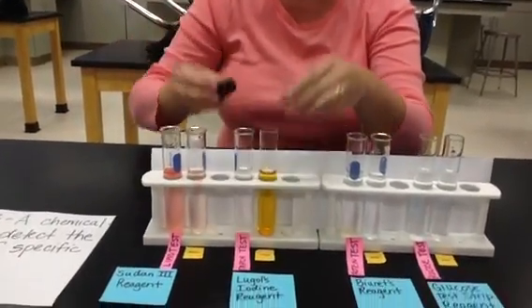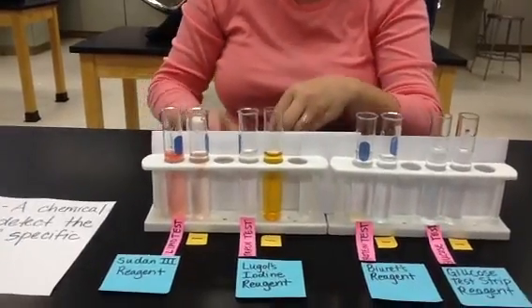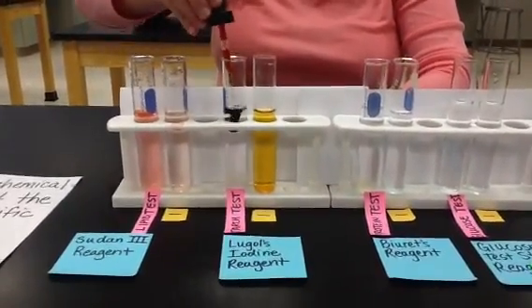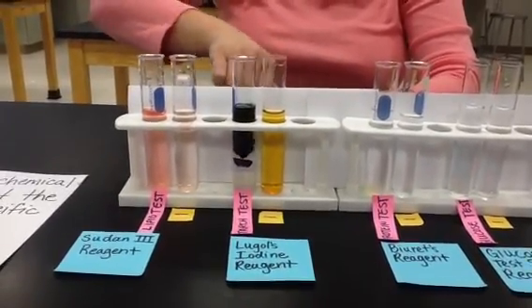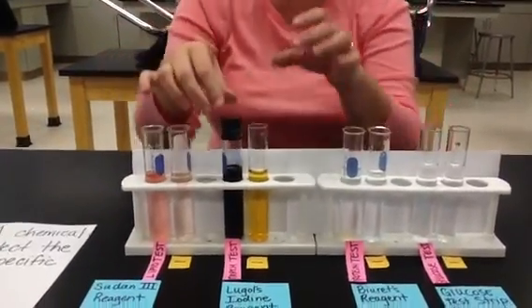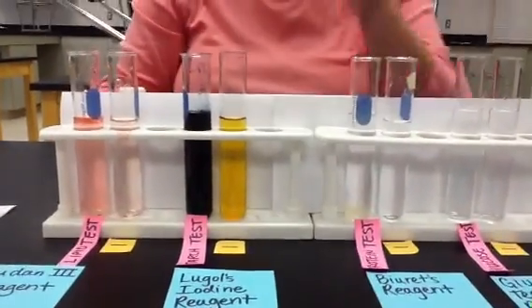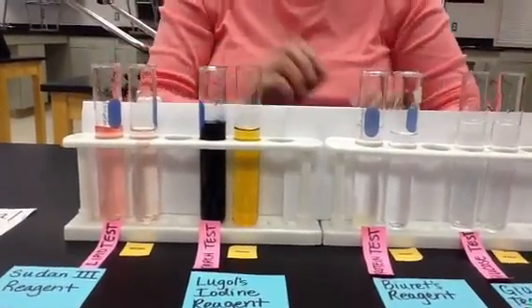And if it's a positive test, so we're hoping this is positive and has starch in it, it should turn like a dark blue, almost black color. And I think that's what we're seeing. I'm going to mix that one up, and that's what you should see. This is a positive test for starch and a negative test for starch. This means there's no starch in this using Lugol's.